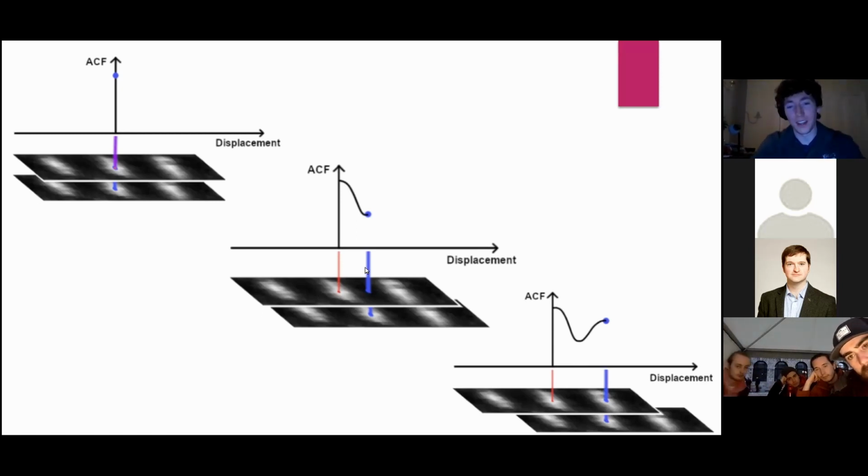You can, but it's really too much for us to do at the minute, mainly because we are trying to do this live at the microscope, and to actually model it precisely is sort of excessive for what we need. We only need an impression of width, and the autocorrelation function provides that.